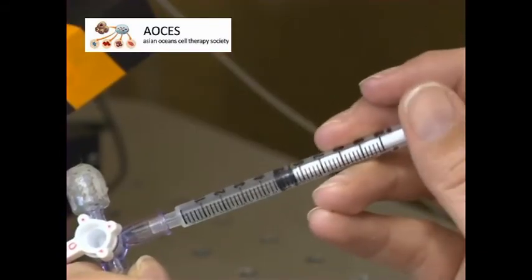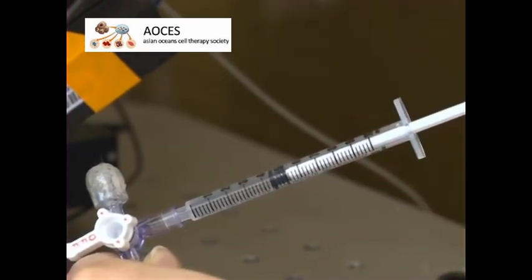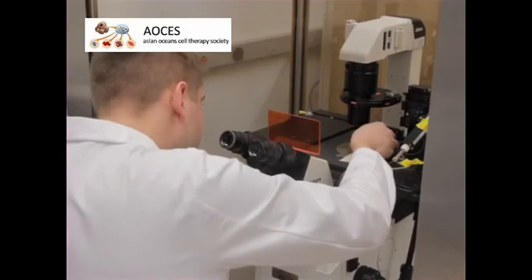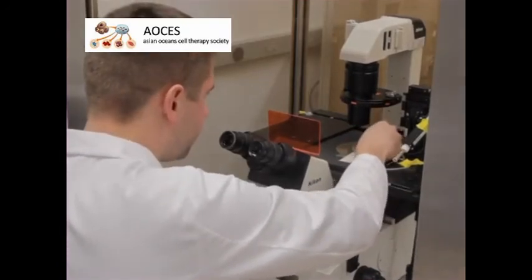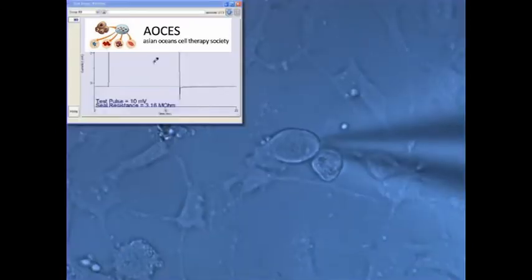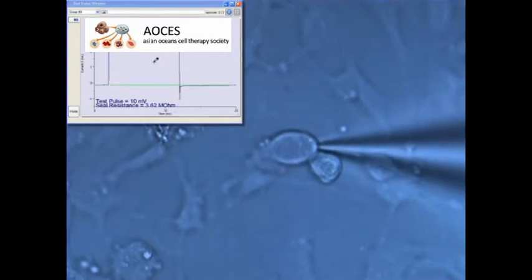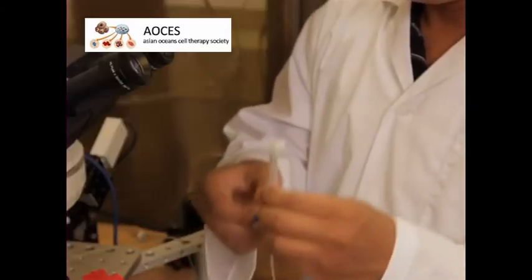Once attached, use a syringe to apply positive pressure to the pipet, which prevents other solutions from entering the tip. Now, place your cells or tissue of interest on the microscope stage and move the micropipet towards a cell. With the amplifier generating test voltage pulses, record the resistance, which will increase once the tip is touching the cell.